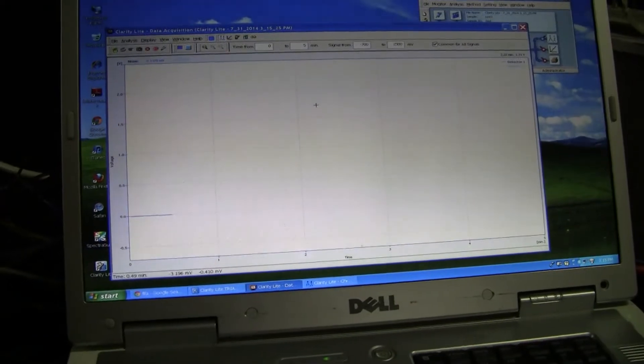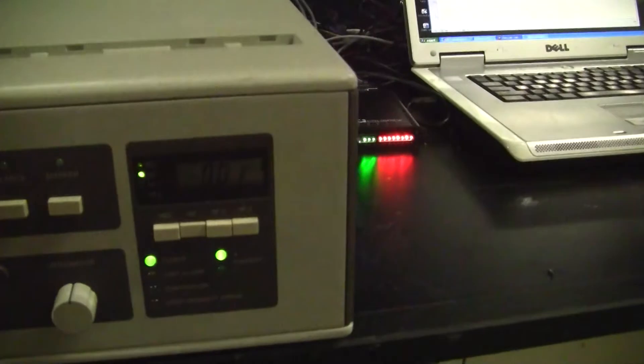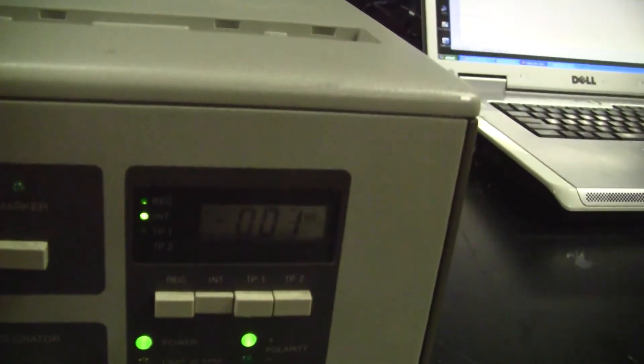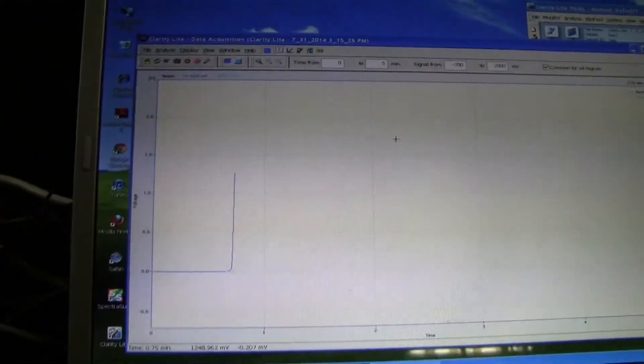Any minute now we should be seeing a nice peak. See some flutter, and there we go. And we'll see that also being represented over here also.